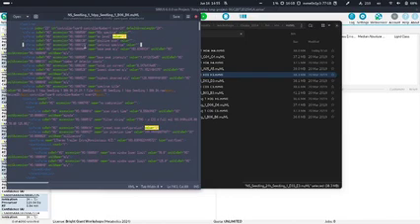And what is important for pretty much everything, we are using MS2 data for most of the analysis parts. So if you want to annotate your data with SIRIUS, you will want to make sure that you actually have MS2 data in the files you drag into SIRIUS.